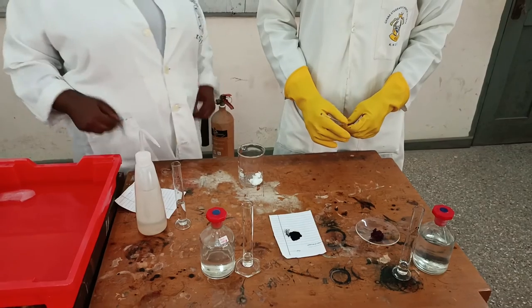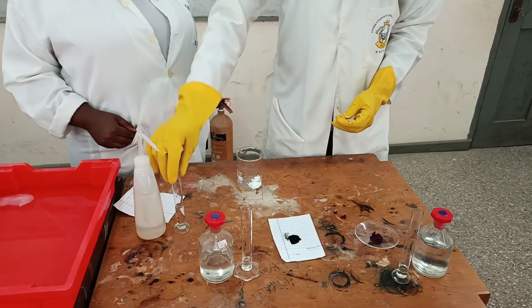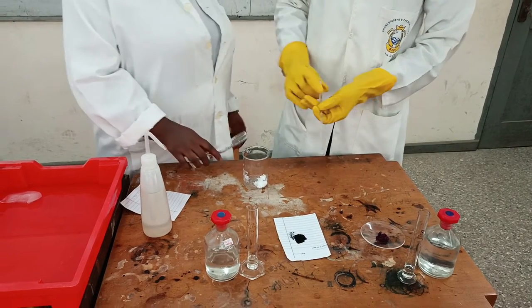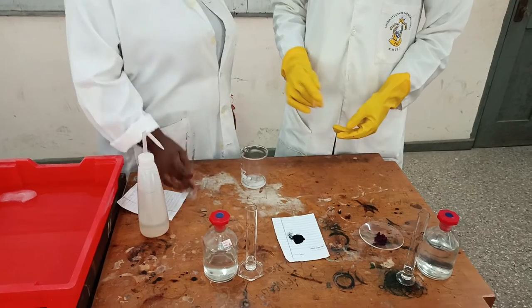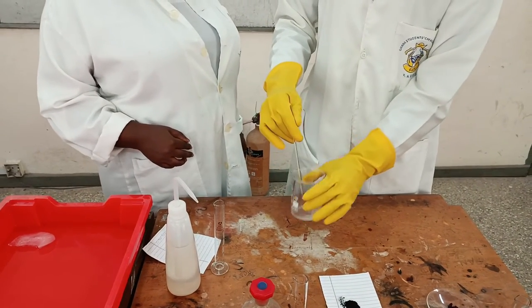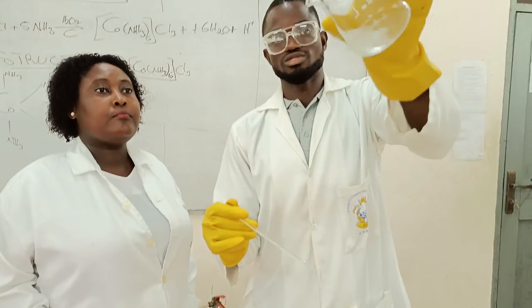Now, since it's a salt, we would like to dissolve it. So my lab technician will dissolve that. We have measured about 15 ml of distilled water. Beautiful. All right. So you swirl or you stir till everything dissolves, as you can see. It is completely dissolved.